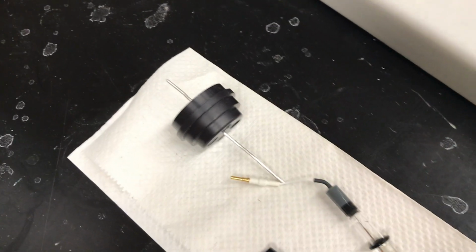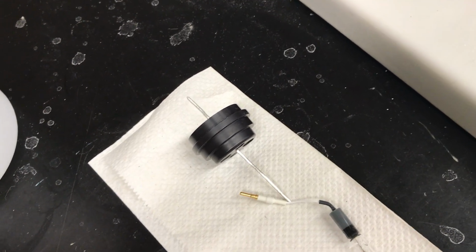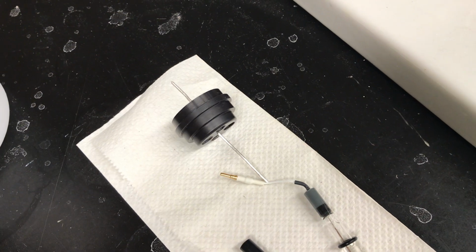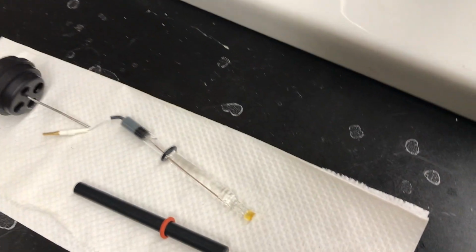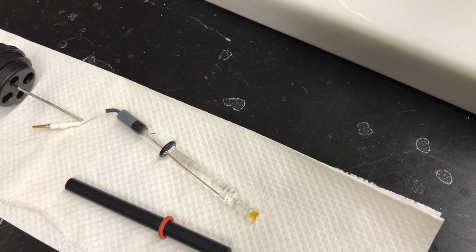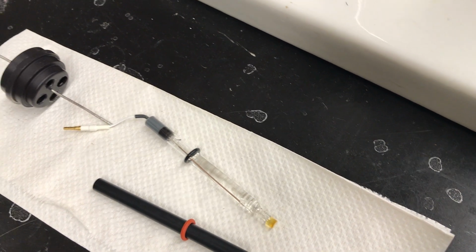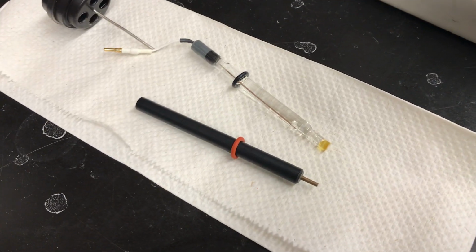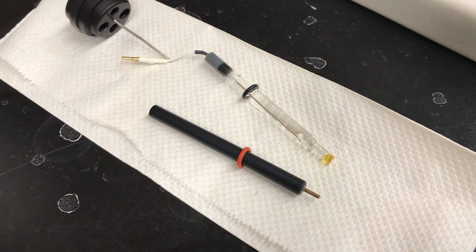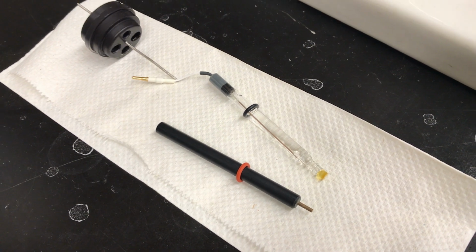The silver colored electrode that you see at the top is actually a platinum rod, and that will be our counter or auxiliary electrode. We'll also need a reference electrode. That's the one that you see right here. It sort of looks like glass, and that's a silver chloride reference electrode. And then finally the working electrode is the one at the bottom here, and that, as I'm going to show you momentarily, is going to be a carbon disc electrode.